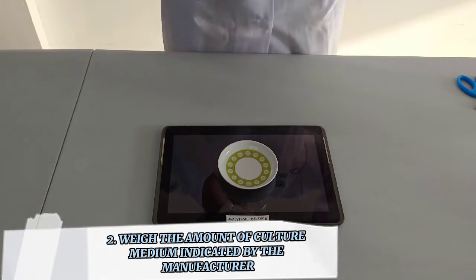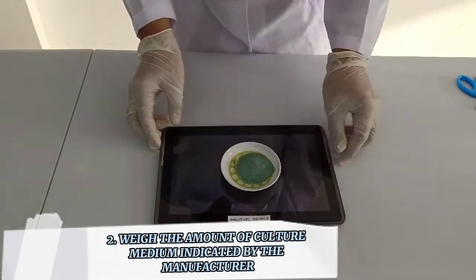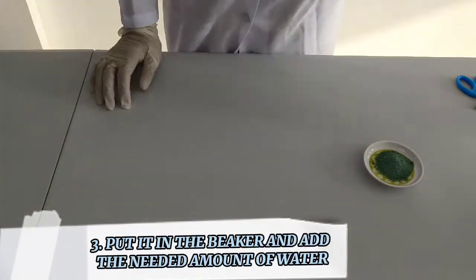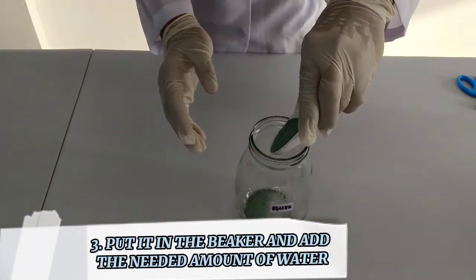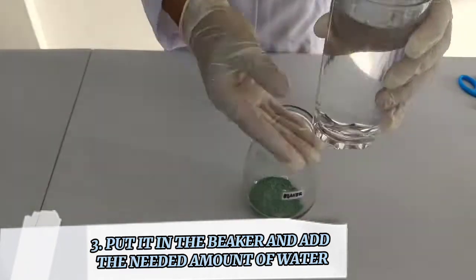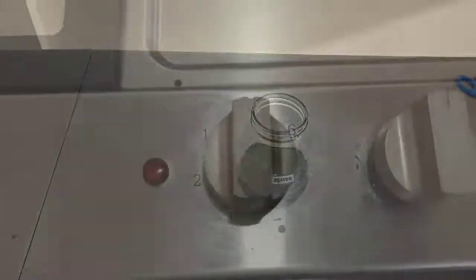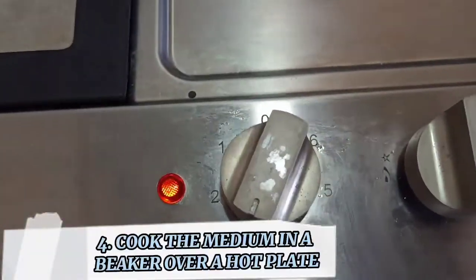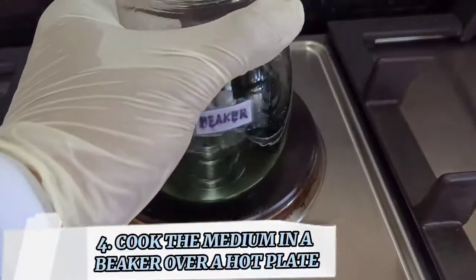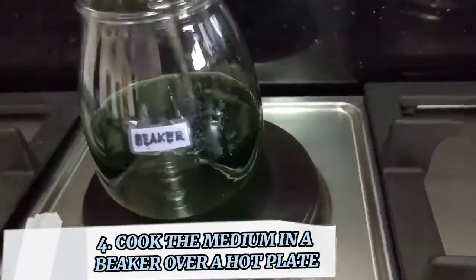Weigh the amount of the culture medium indicated by the manufacturer. Put it in the beaker and add the needed amount of water indicated by the manufacturer. Cook the medium in the beaker over a hot plate and continuously stir it with a stirring rod.